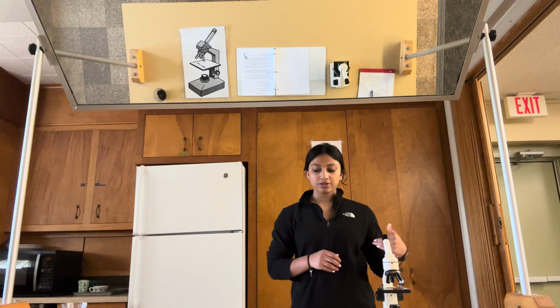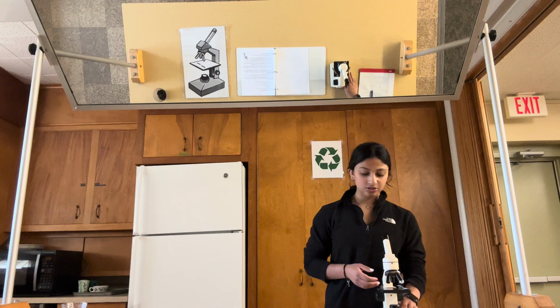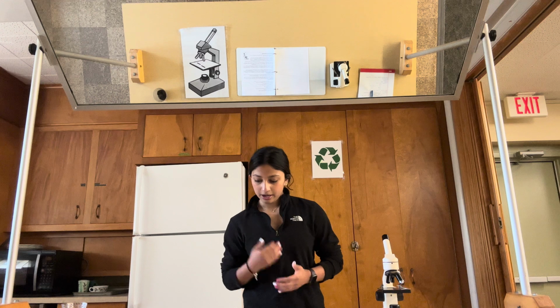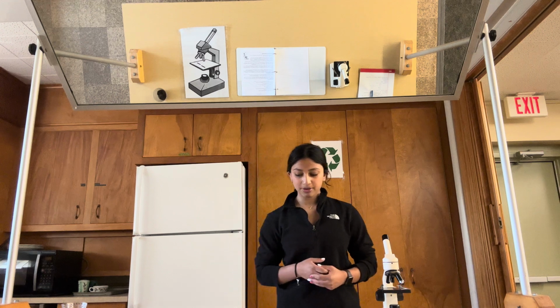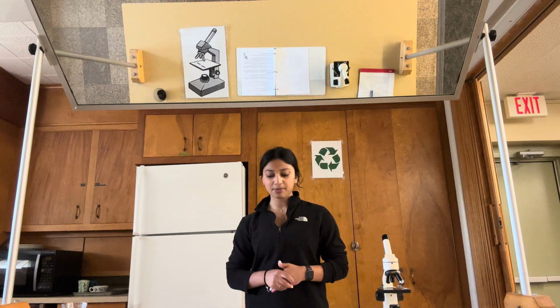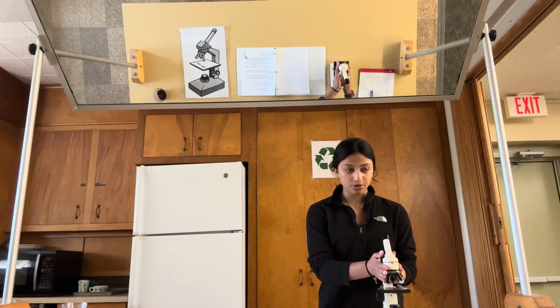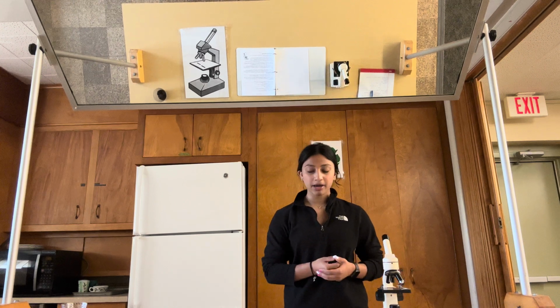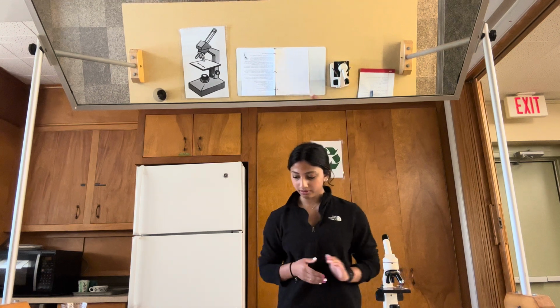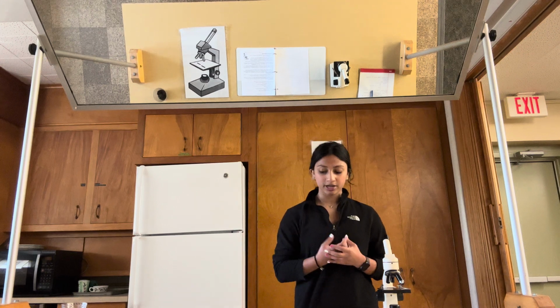Light microscopes use a bulb or a mirror as their light source, and the switch for this light is usually found on the base of the microscope. You can control how much light goes through the specimen by adjusting the diaphragm. After the light has passed through the specimen, it enters the objective lens. The shortest of the three objectives is the scanning power objective lens, which has a power of 4x. And it goes up again to the highest power lens of 40x.